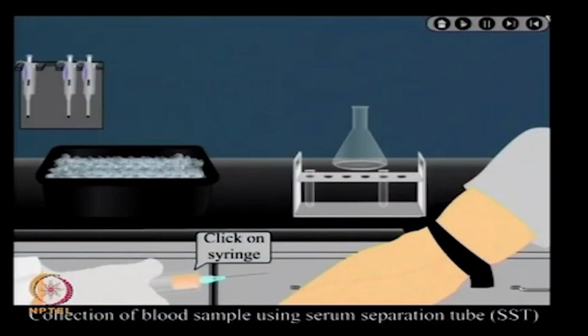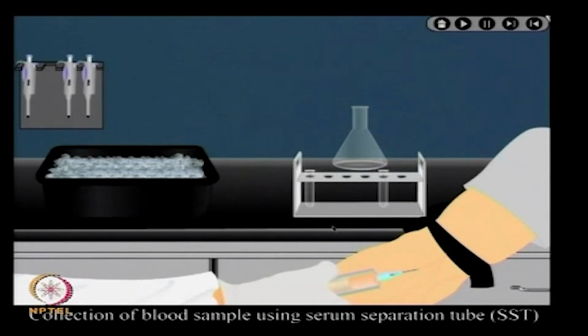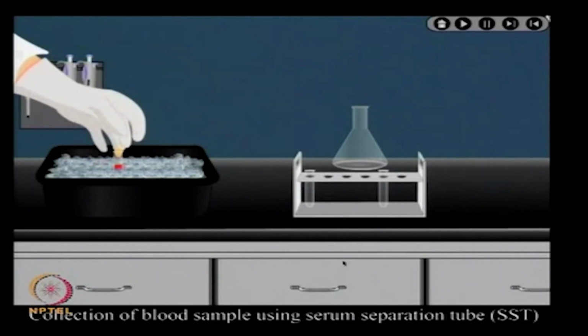Serum proteome analysis. In this interactive animation, I will show you stepwise how to collect serum and how to perform the proteome sample preparation. So, first click on the syringe so that blood can be collected. The blood proteome is one of the most complex components of the human proteome.